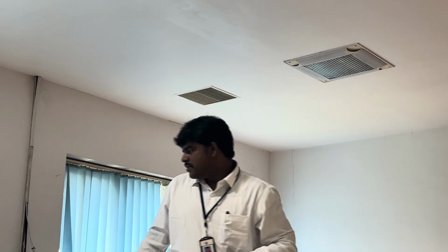This entire presentation describes two things. One is the basic fundamentals while working in the QC laboratory, what we need to learn. And second, the calculations we do in the daily work environment, whether in the wet lab, in chromatography, or in GC. I am explaining the basic calculations. So, let us start with that.